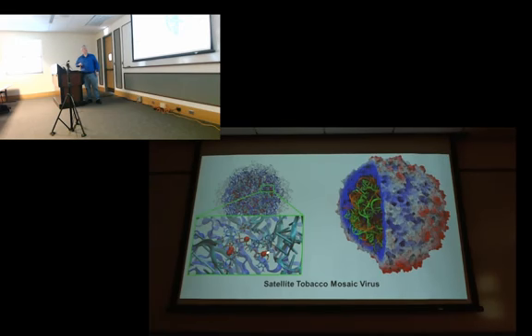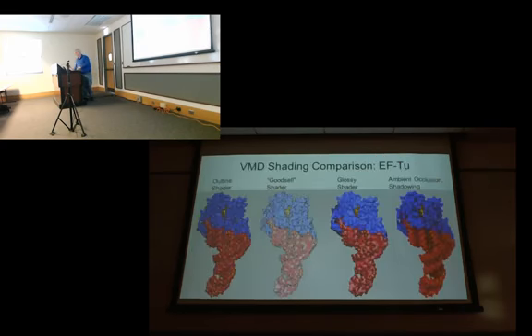And this one, there's also depth cueing, so you can see the atoms in the front are very saturated. They have a strong color. And as you go back in the scene farther away from the camera, they're sort of washed out. And that's what fog does. And so by using fog in combination with the lighting, you can also accentuate depth more even than it would just with the lighting itself. So you can use these different things together to make more compelling renderings.